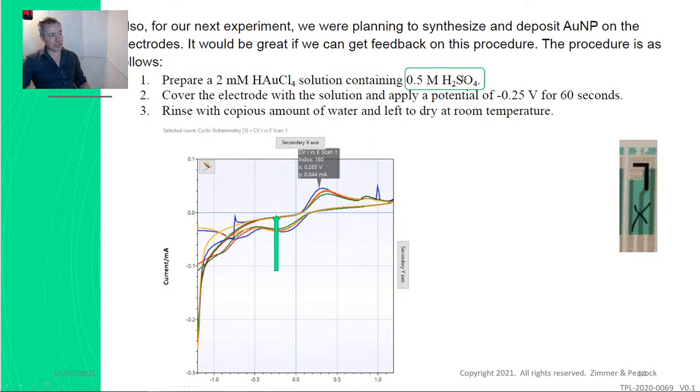And what I suspect is that sulfuric acid might end up sort of darkening the counter and the reference, which should be okay. You should hopefully be okay, but just try it is my quick answer. If anyone's got any experience, let me know and we can bring it up next week.